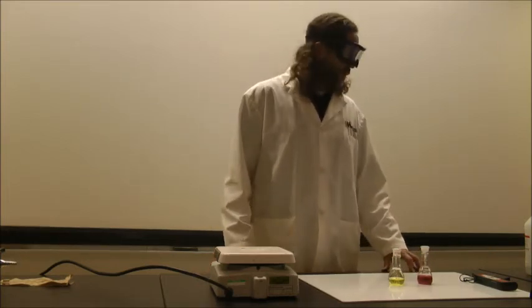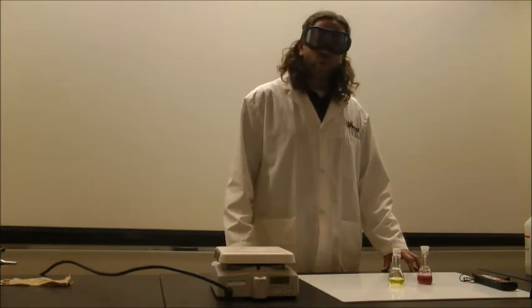So first I'm going to show you some molecules that are fluorescing. To make a molecule fluoresce, it's pretty simple. We're just going to shine some ultraviolet light into the molecule. So there you can see, whenever I shine ultraviolet light on my hand, you can't really see anything. But when I shine it on these chemicals, you can see a faint glowing of red there, right?